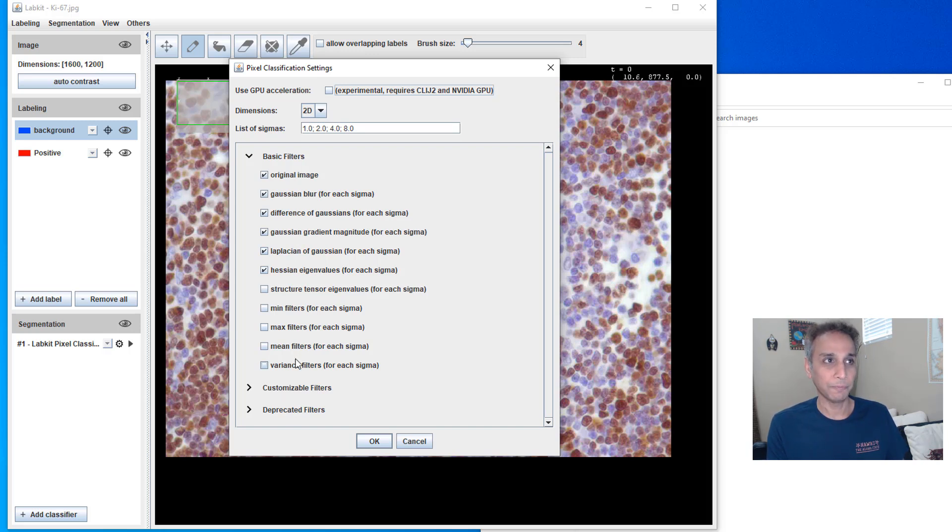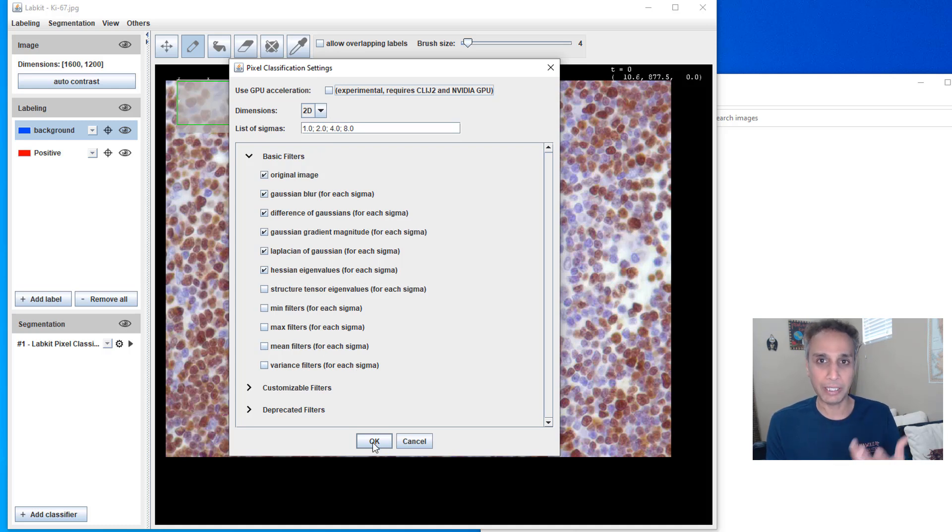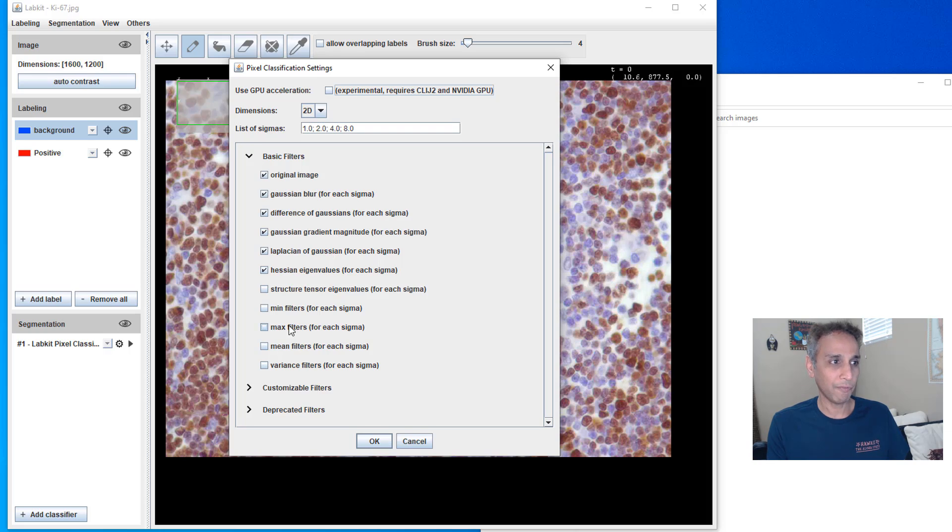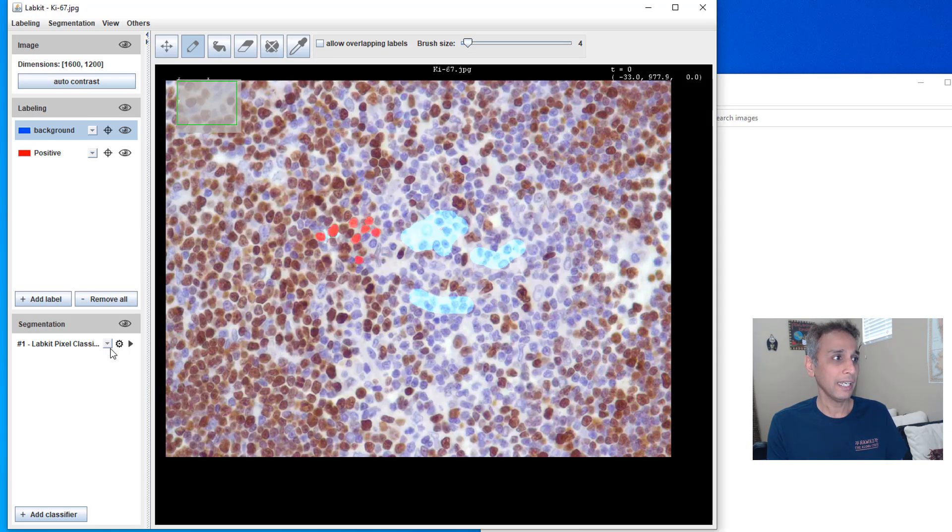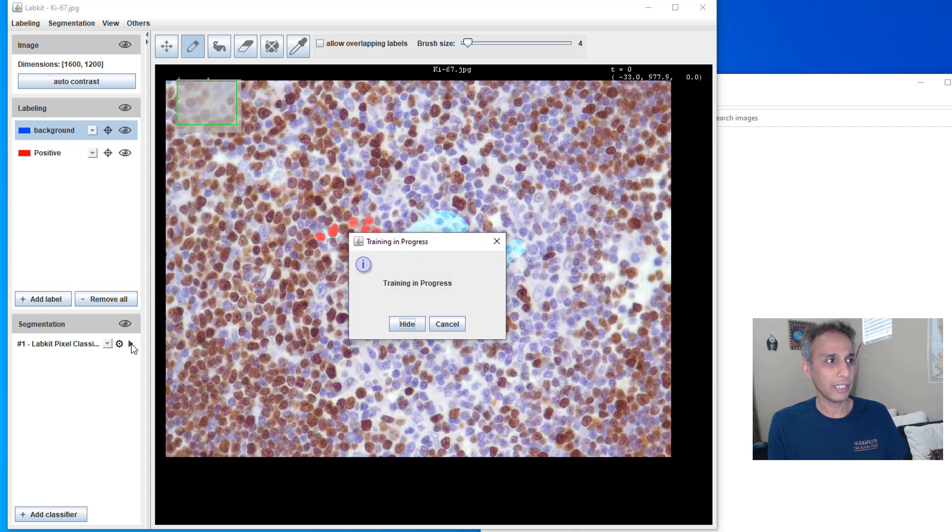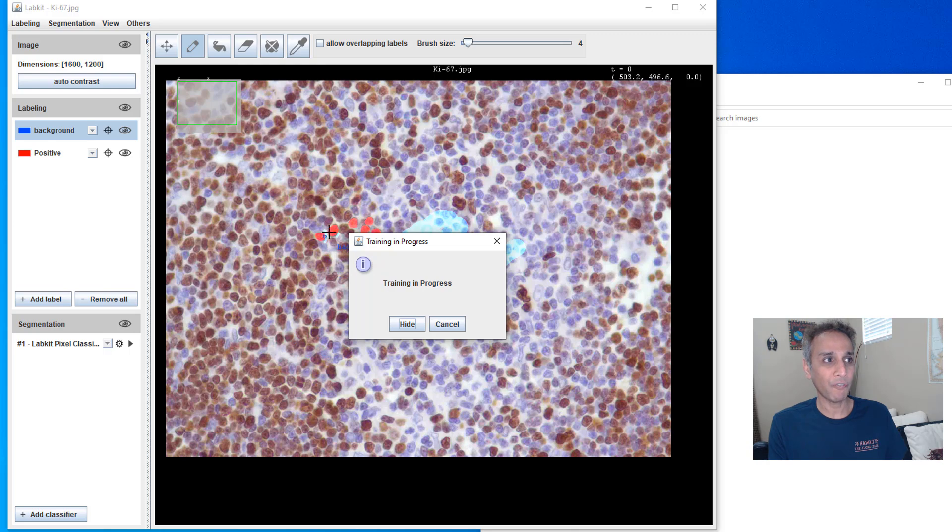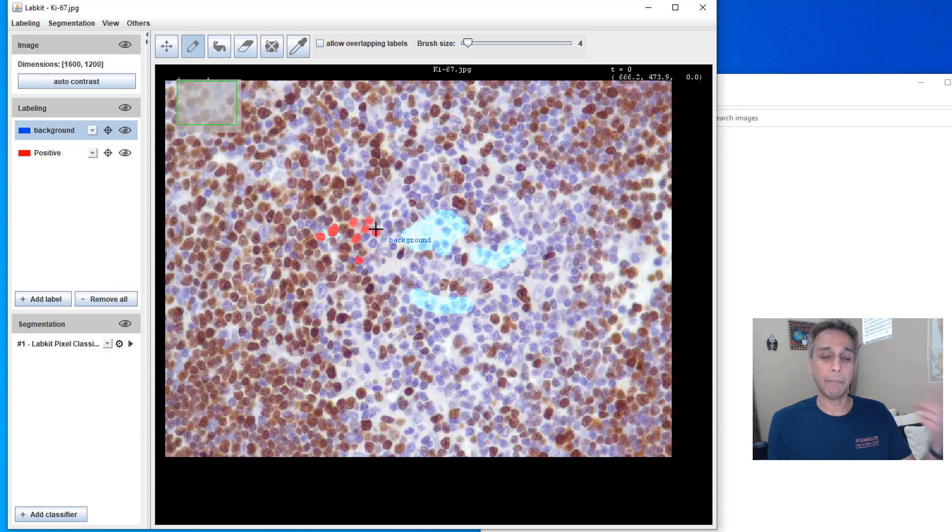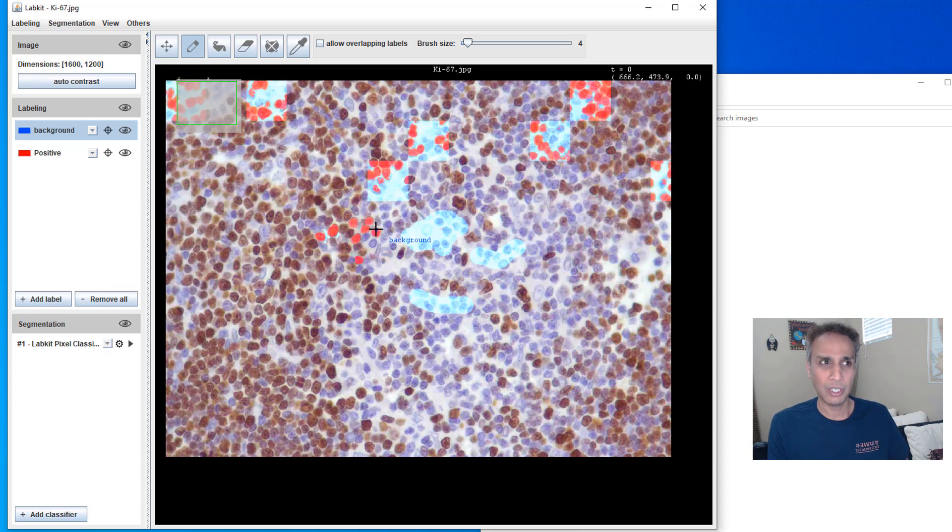This is feature extraction. Based on this, it's going to apply random forest and then segment these images. So let's say, okay, I'm okay with these default filters, features for now. So let's say, okay, and the key is, now let's go ahead and click on this arrow right there.